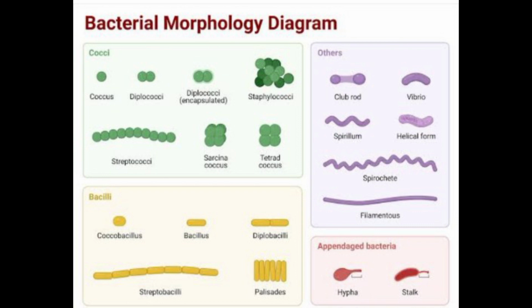Demonstration: flagella are about 0.02 micrometer in thickness and hence beyond the resolution limit of the light microscope. The following methods are used for demonstration: dark ground illumination, special staining techniques in which the thickness of the flagella is increased by mordanting, electron microscopy. Indirect methods: swarming growth on agar, hanging drop preparations, and the Craigie tube method.